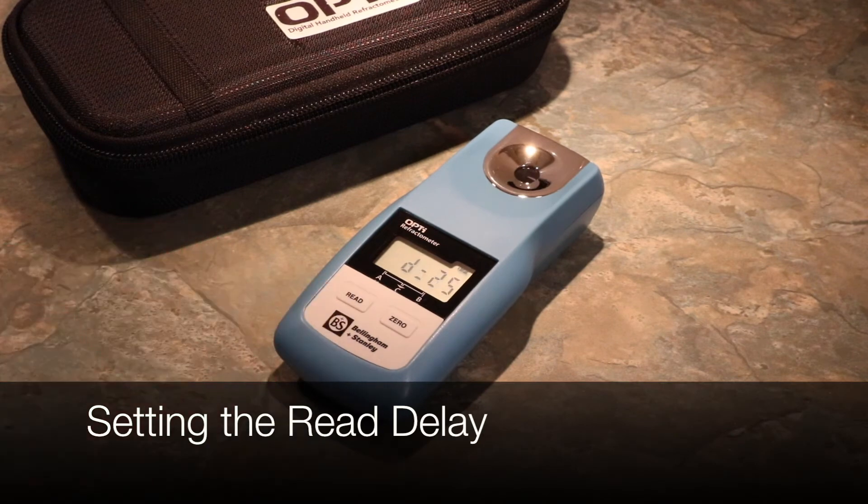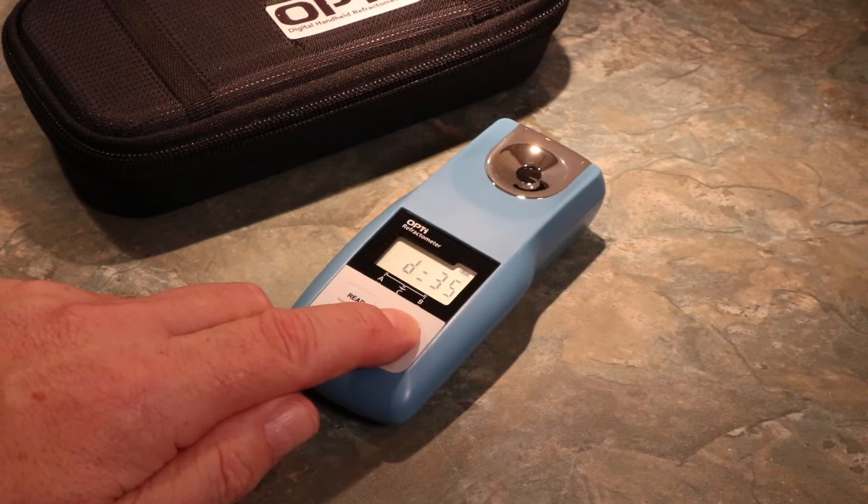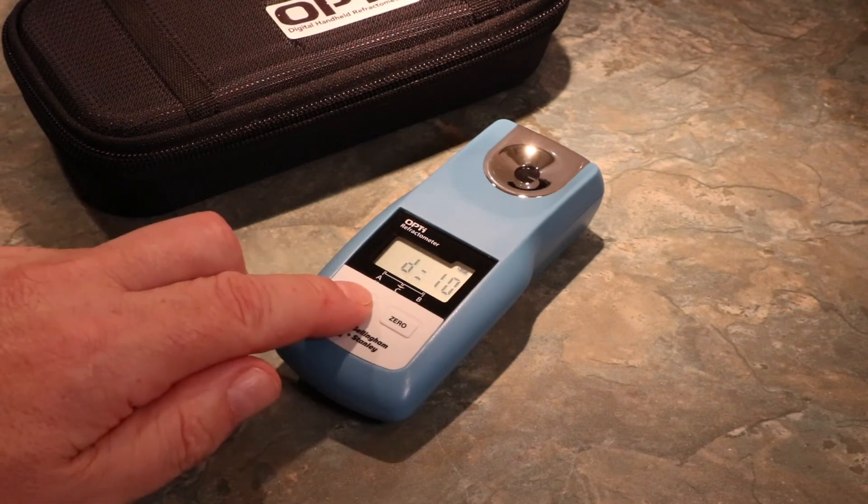To alter or set a new Read Delay, cycle with Zero and confirm with Read. In this example, we are changing from a Read Delay of 25 to a new time of 10. Press Read to enter this setting.